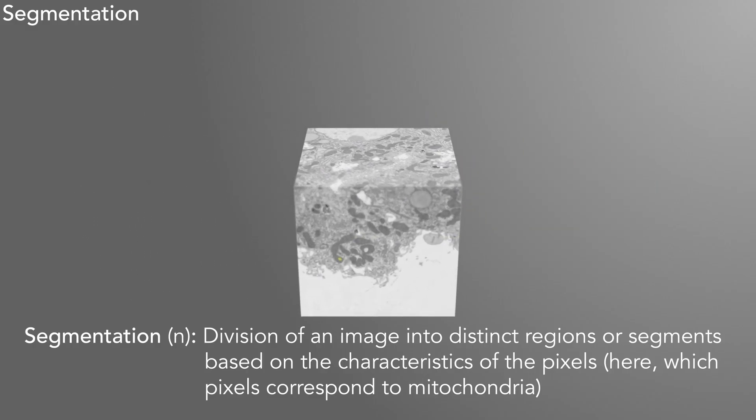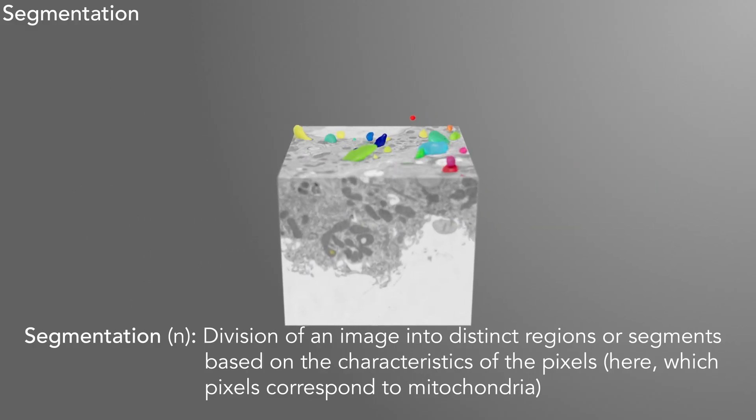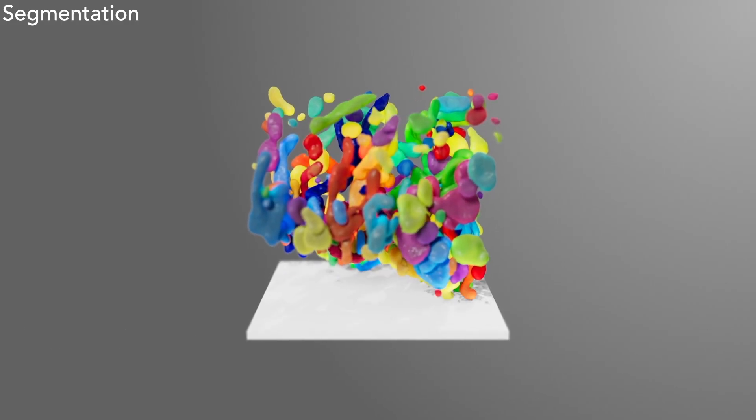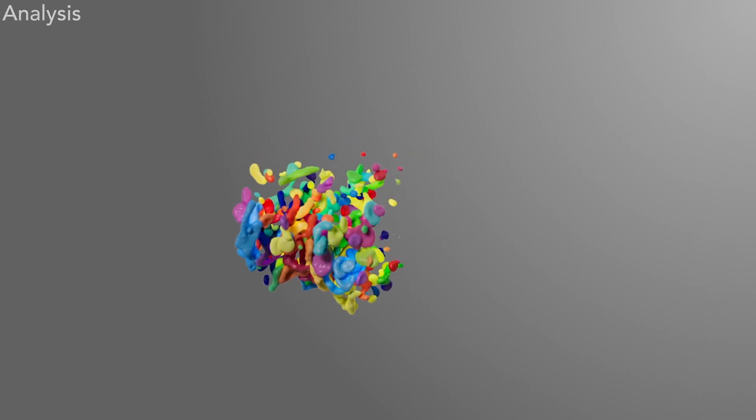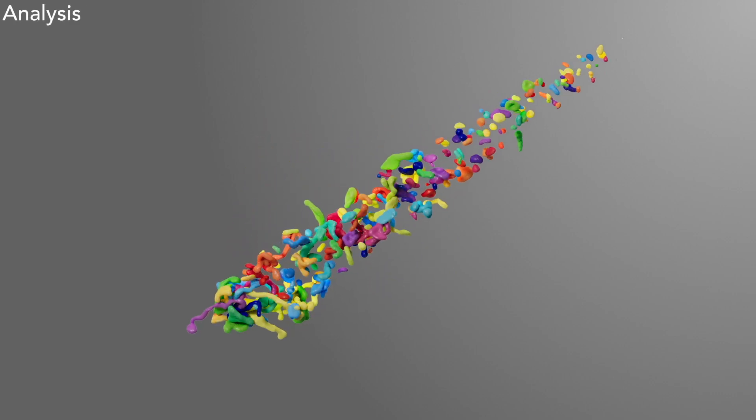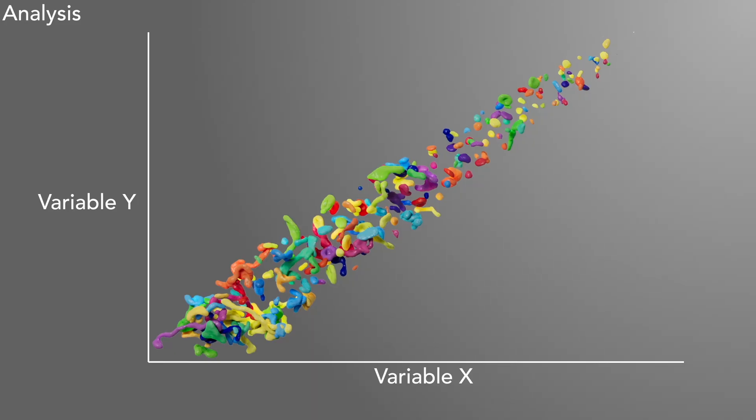These are of course 2D segmentations on a single image, and you can imagine that accurately segmenting all the mitochondria in the entire image volume will generate not only visually informative 3D renderings, but also these individual renderings of mitochondria can then be used for downstream analysis.